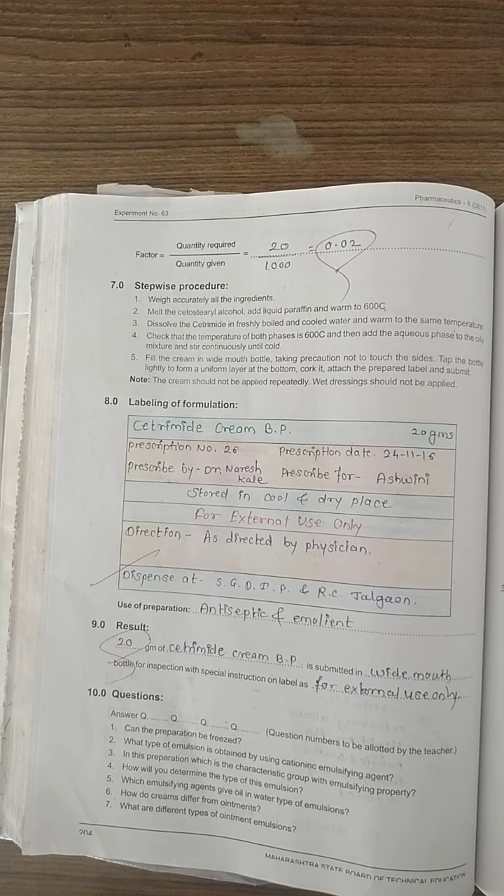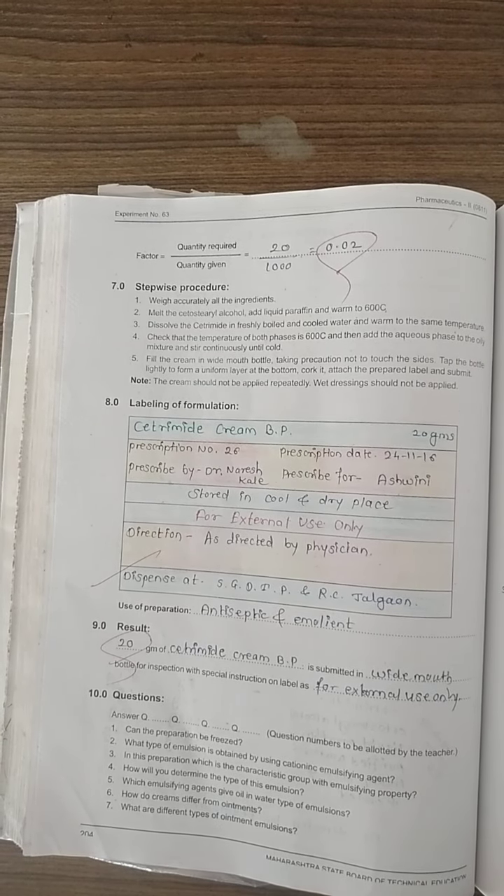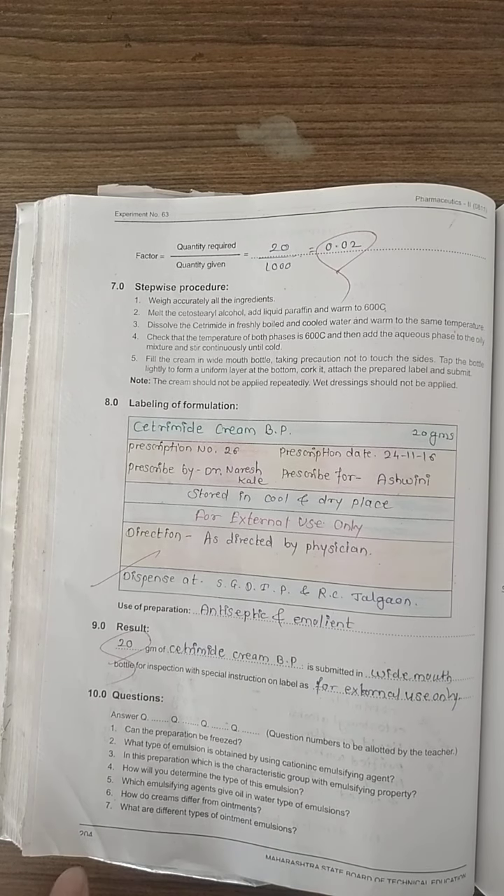When the cream is prepared, fill it into a wide-mouthed bottle. Do not touch the sides of the bottle; touch only the bottom. Tap the bottle lightly to form a uniform layer at the bottom. Continue tapping until the cream is uniformly set at the bottom of the bottle, then attach the label and submit it.